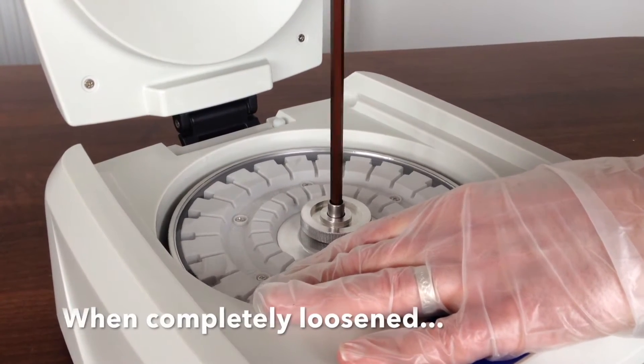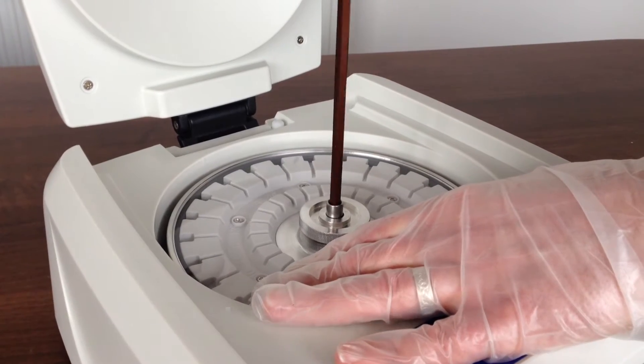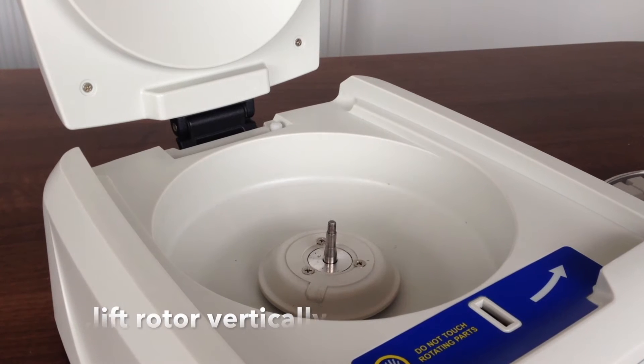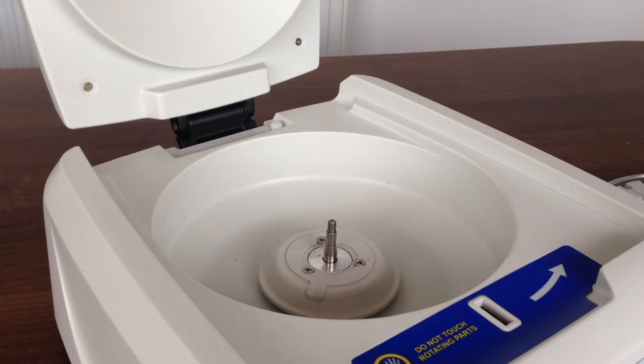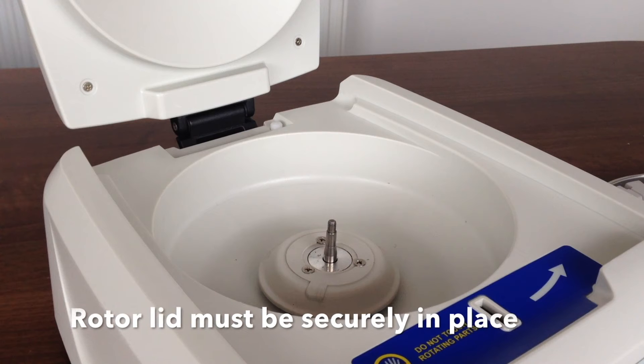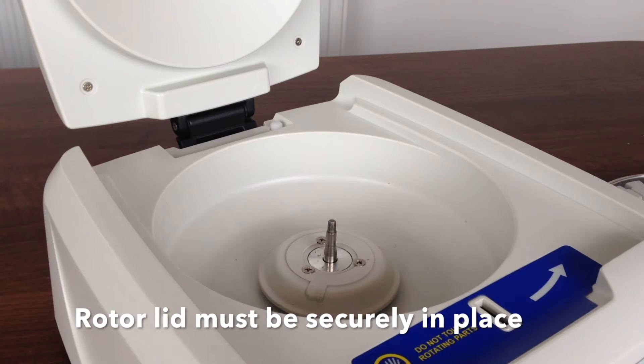Once the rotor nut is completely loosened, lift the rotor vertically. Be sure to keep the rotor nut safe with its rotor lid secured. The rotor lid should be left attached to the rotor after removal and should be left in place while refitting.